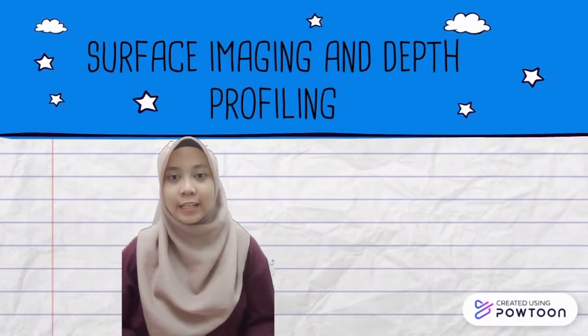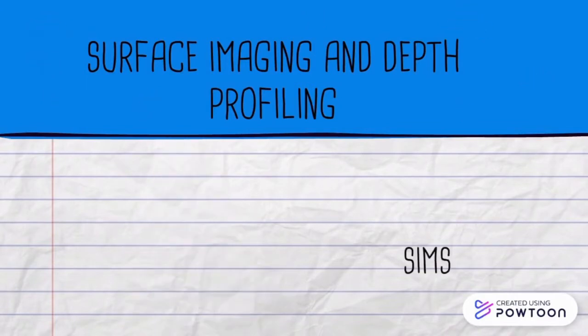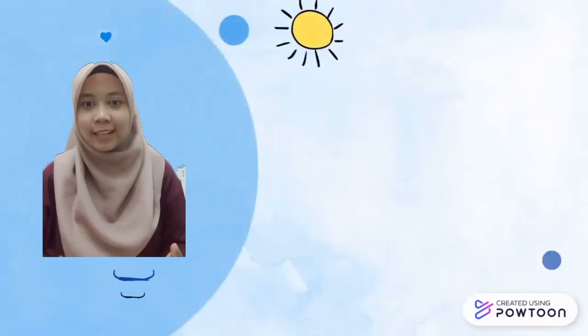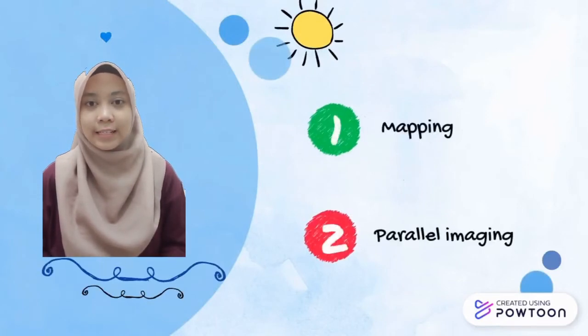Next, we move to the process of surface imaging and depth profiling for these two methods, which are XPS and SIMS. There are two techniques to obtain the XPS image, which are mapping and parallel imaging.